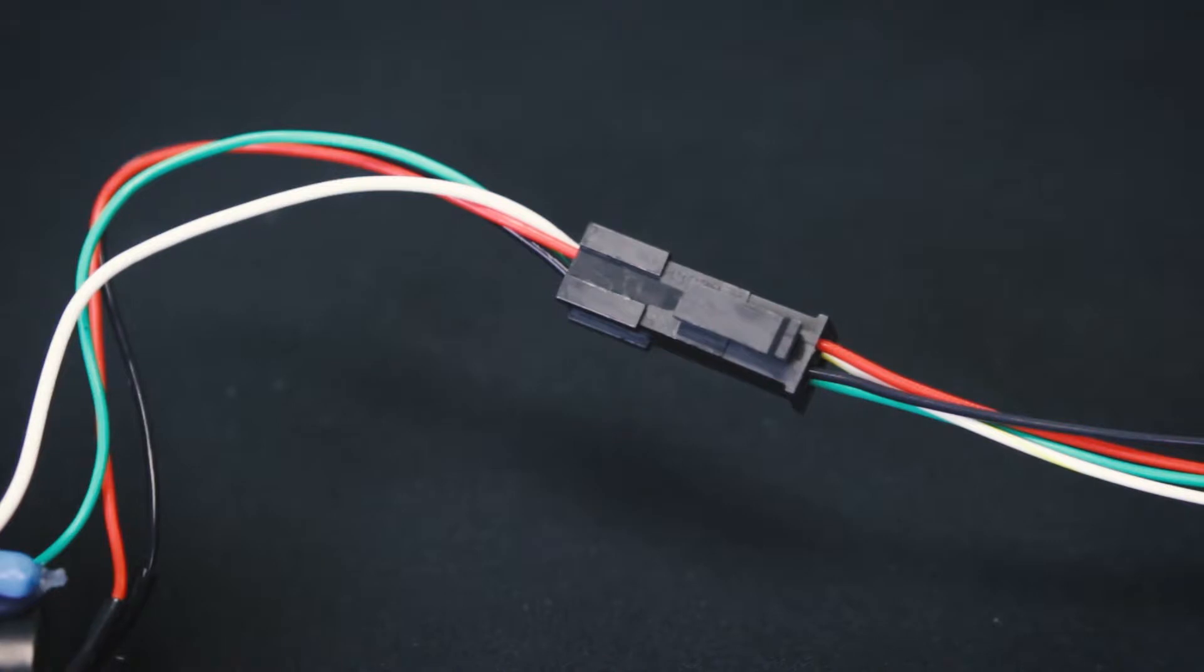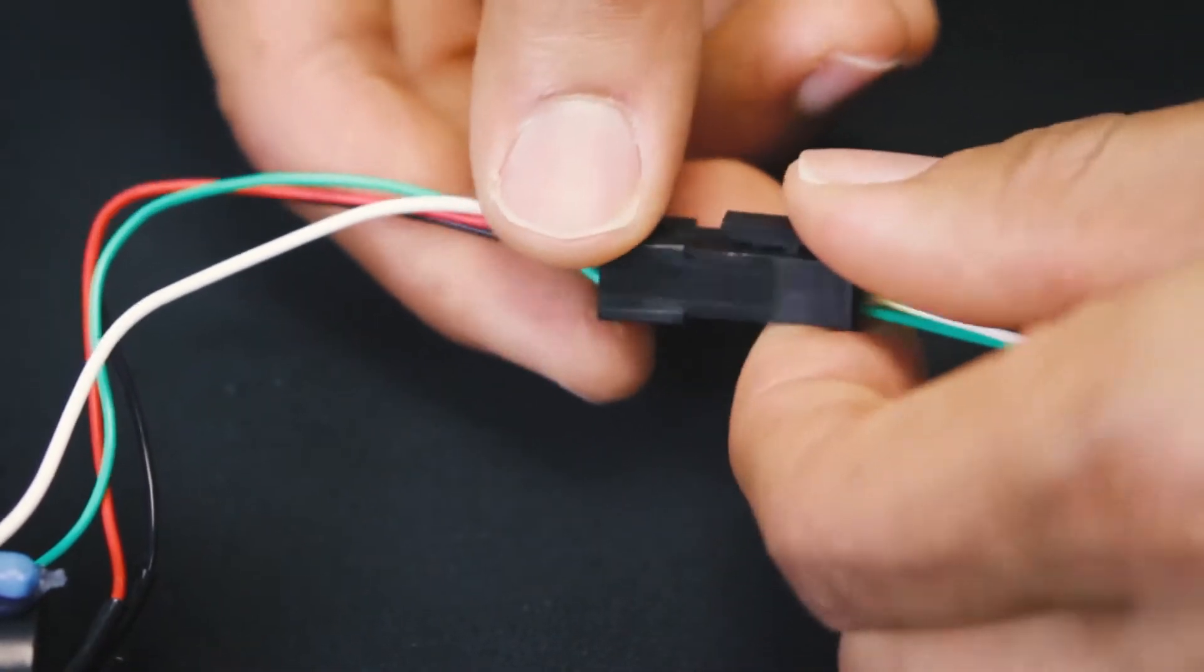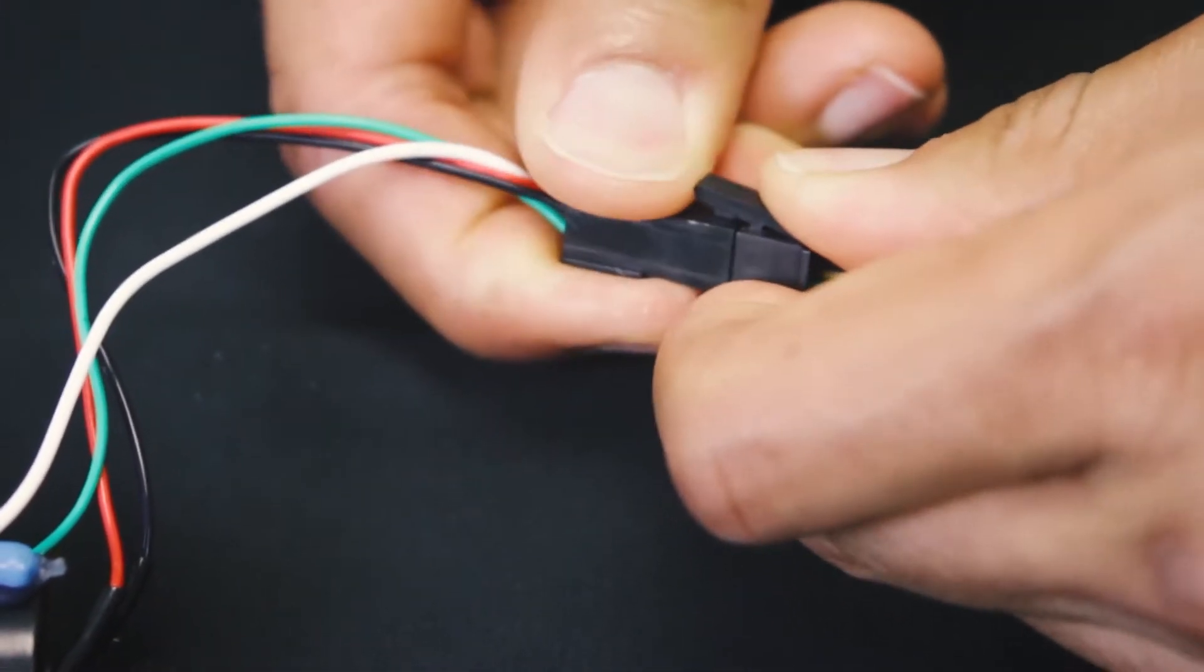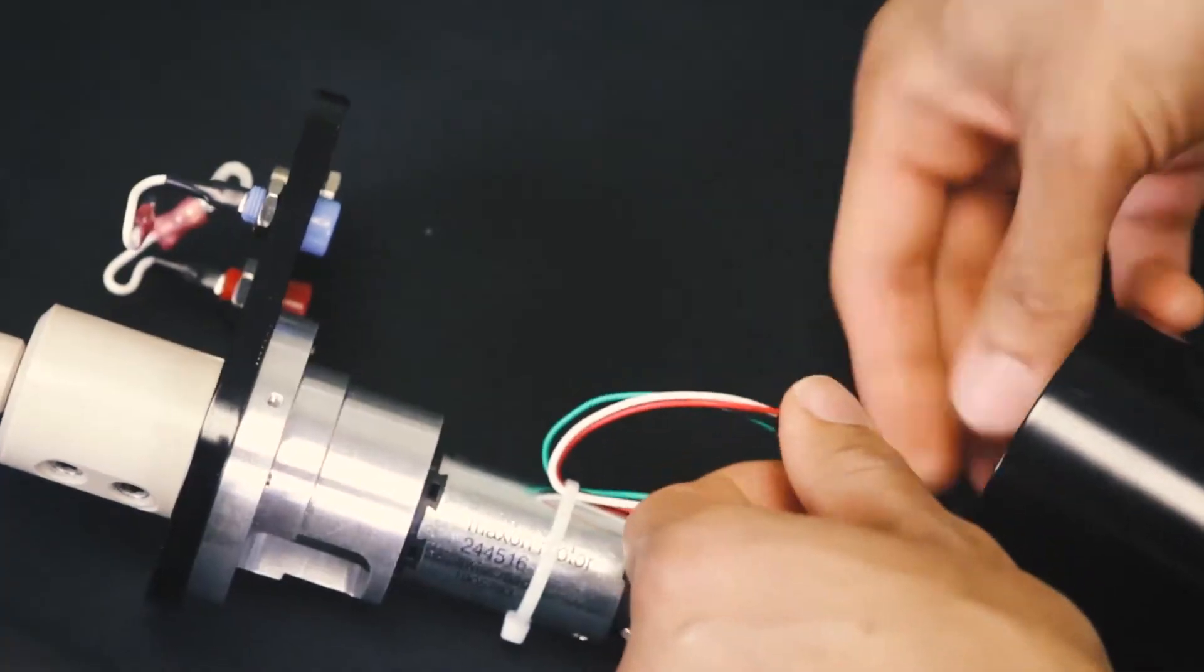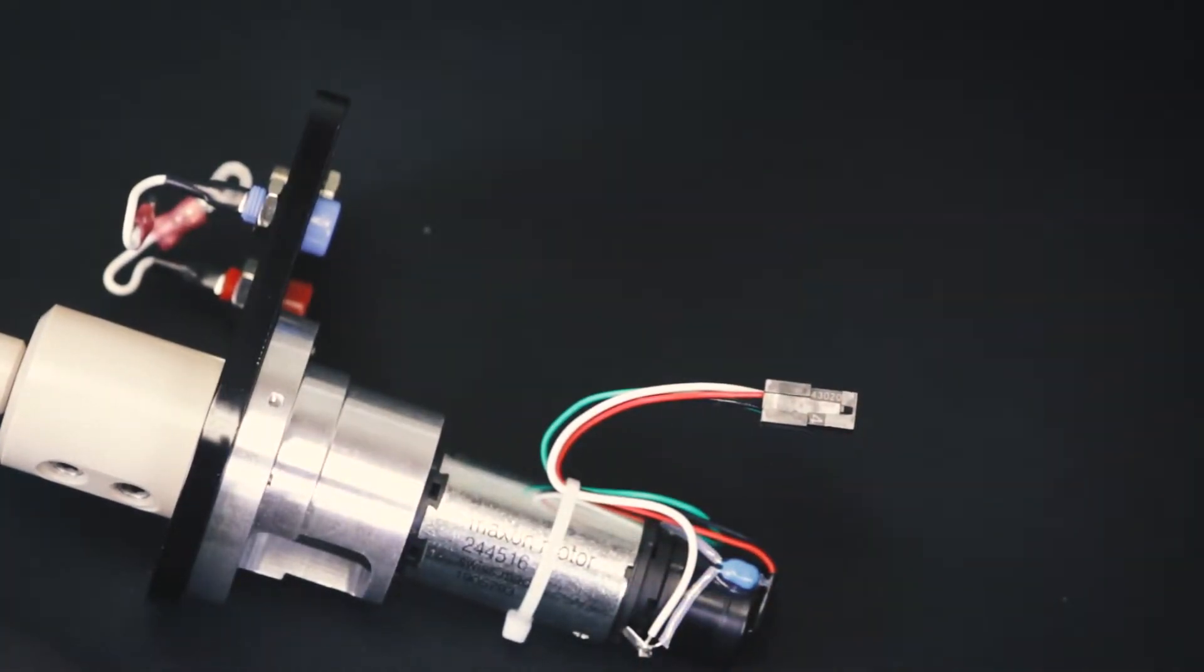Unclip the motor wire assembly by pressing this lever and pull the motor housing from the motor head. Place the motor housing off to the side.